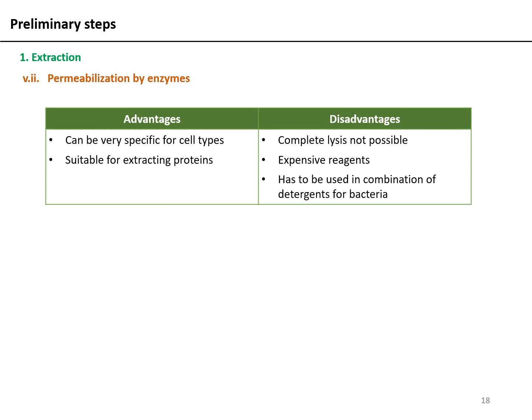In the coming lectures, we will be discussing how to separate the soluble fraction, which contains your protein of interest, from the cell debris, which is essentially done by centrifugation. We will discuss in detail the different types of centrifugation and when to select which kind.